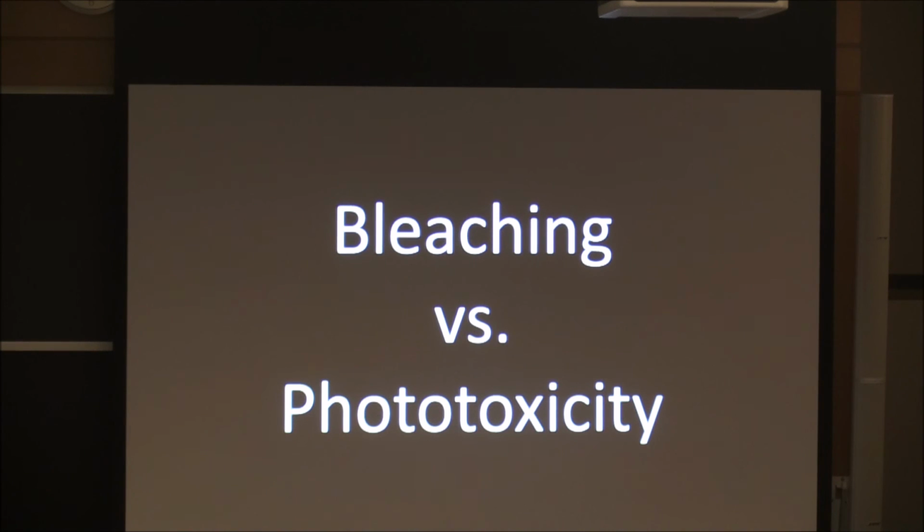On the other hand, phototoxicity occurs when the biological molecules that are inherent to your sample absorb all of that excitation light that you're pouring in there, and that does some damage. So obviously if you're hitting your sample with near UV light, you're doing some DNA damage in there. And in this situation, you can still have lots of fluorescence coming out of your sample.